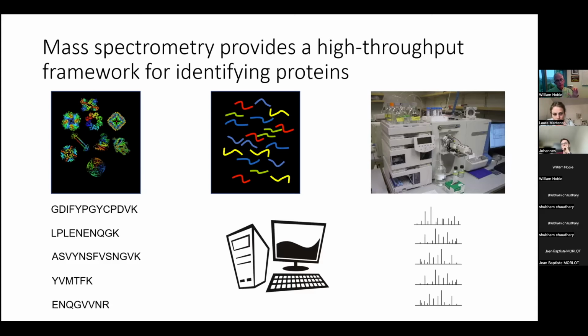There's a whole other part of the analysis which involves then quantifying how many copies of that peptide you expect to be in the mixture. But we're going to focus today just on the identification, or the detection of the peptides in the mixture. So that's the primary data.